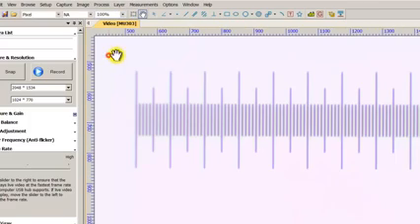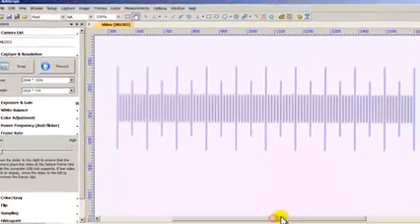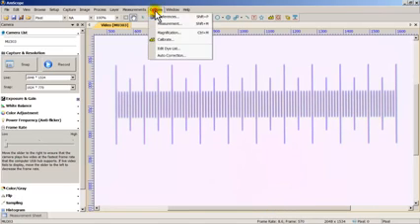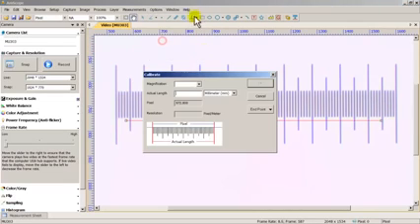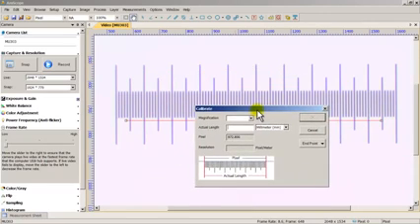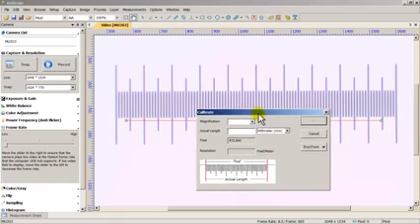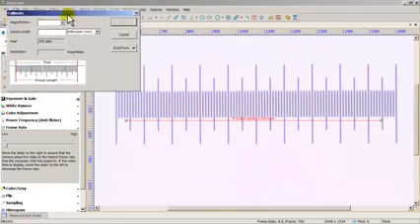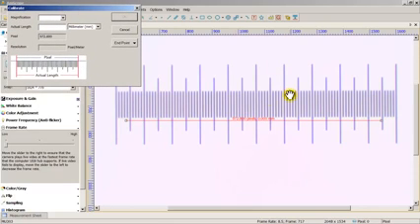Just up here, 100%. And I'm really zoomed in. I can see that it's kind of out of focus, so let me just adjust that again. And readjust focus. Okay, that's a little bit better now. So again, I'm going to go to options and calibrate. After you click the calibration button, it's going to bring up this calibrate box, okay? And I'm just going to move it out of the way a bit. Let's see where I could put it. Maybe over here so you guys can see.